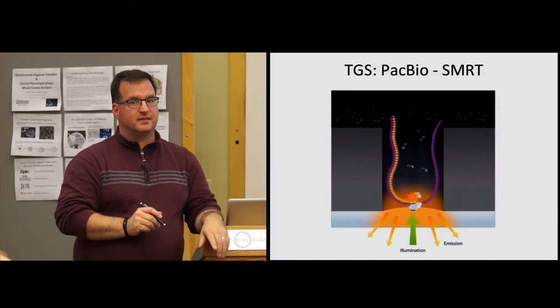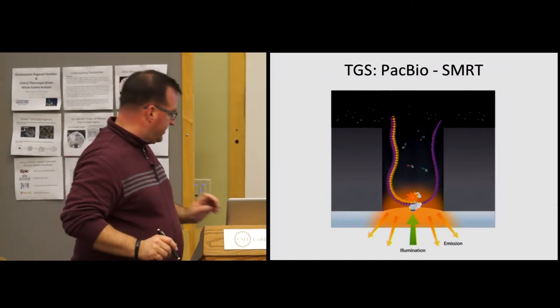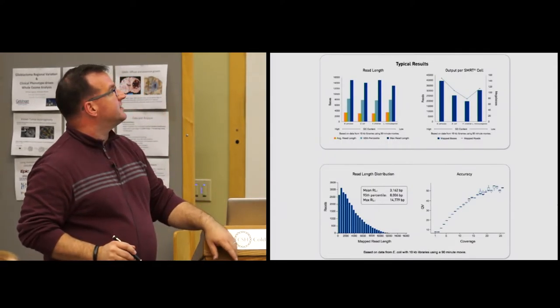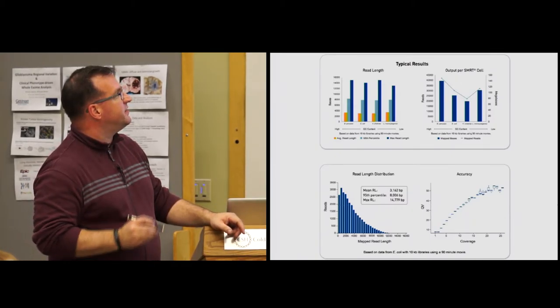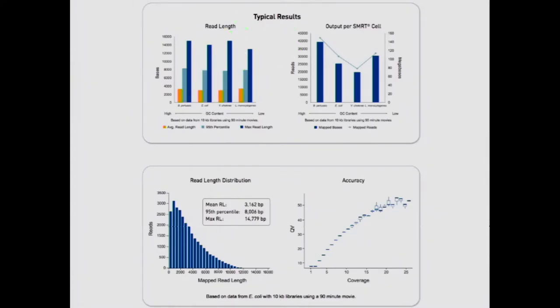Questions about that? How long is long? Yes, good question. So it depends is the short answer, right? So these are some typical results as it says on the PacBio website. Typical meaning this is the best one they'd like to show you.